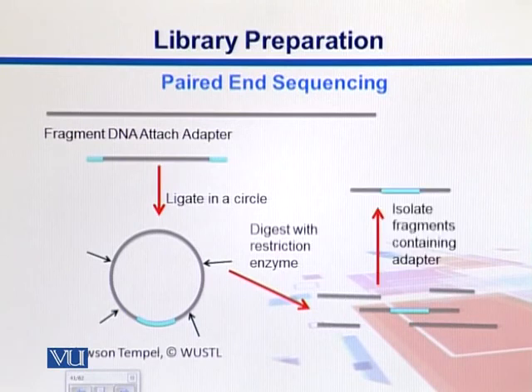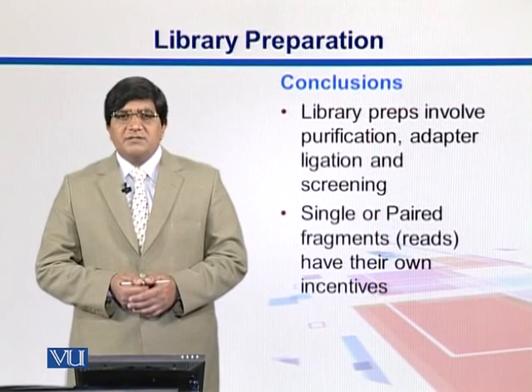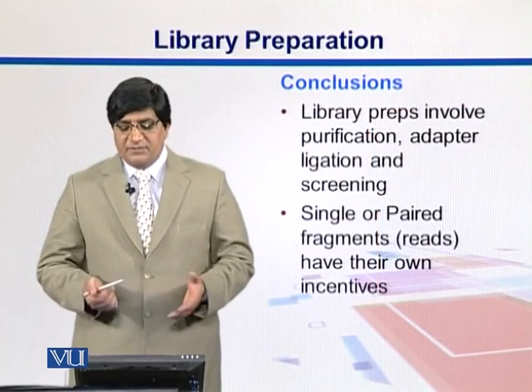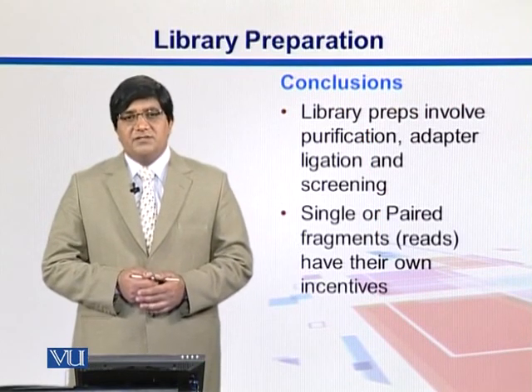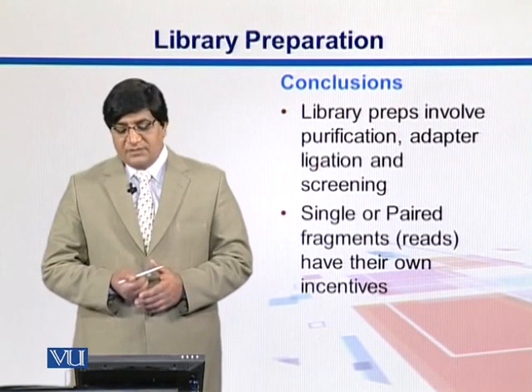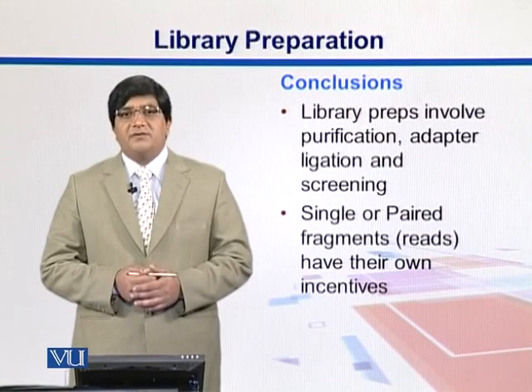We can select those fragments which contain those adapters, and then we can attach the sequencing adapters to these selected segments, and then we present them to the sequencer. So library preparation involves preparation of the fragments for sequencing. That involves purification, adapter ligation, and screening, and we can have single reads, or we can also have paired end reads.